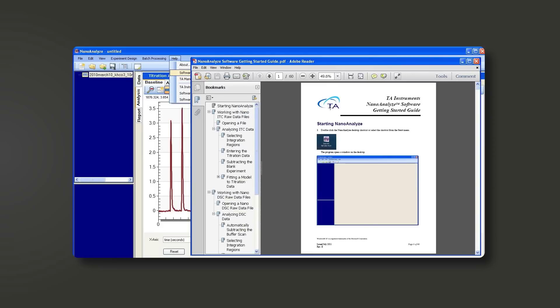Once you have it open, there's your instructions. You can just click it and save it to wherever you want on your computer.